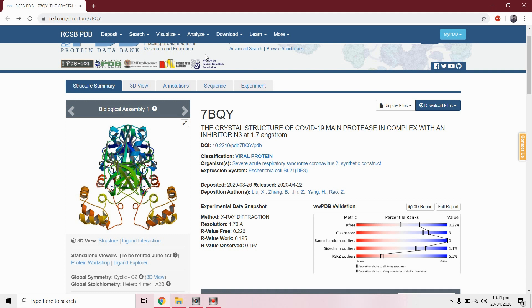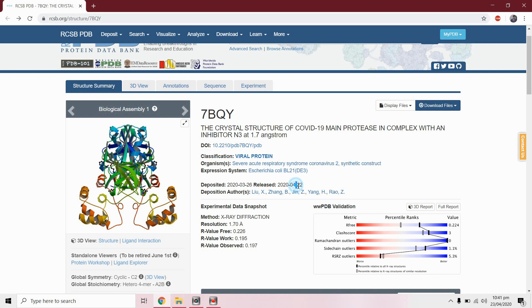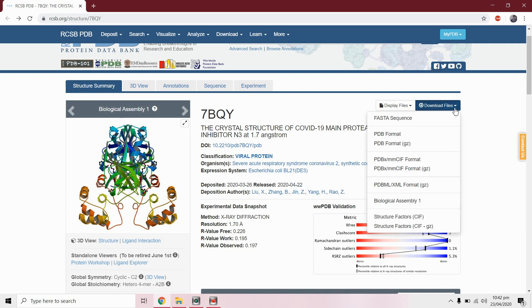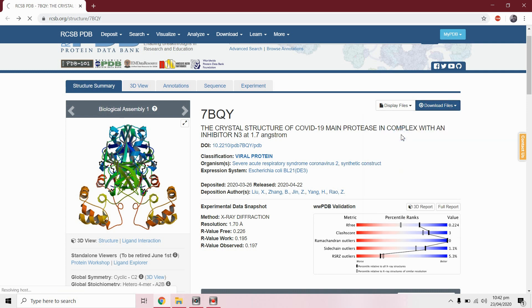In this video we will perform molecular docking by AutoDock using the target protein of COVID-19 main protease. First we will prepare this protein for docking. It's a structure released on 22 April. Let's start - we will download this in PDB format.